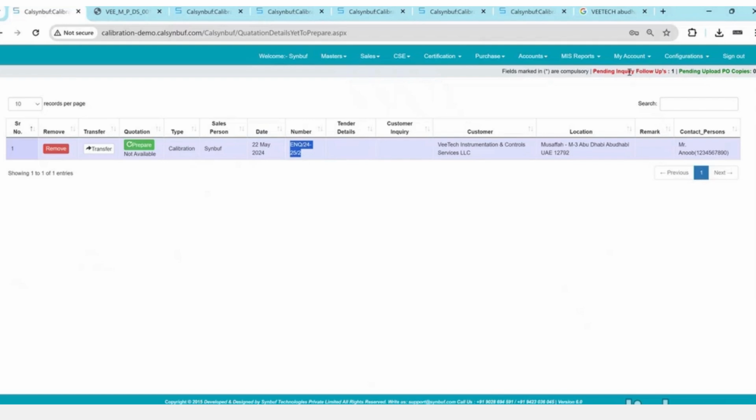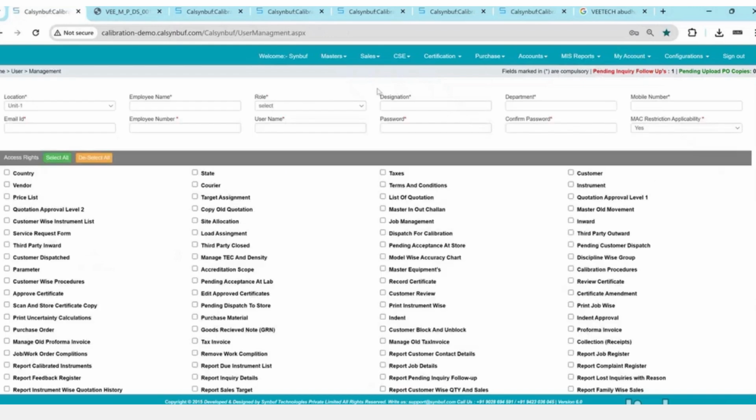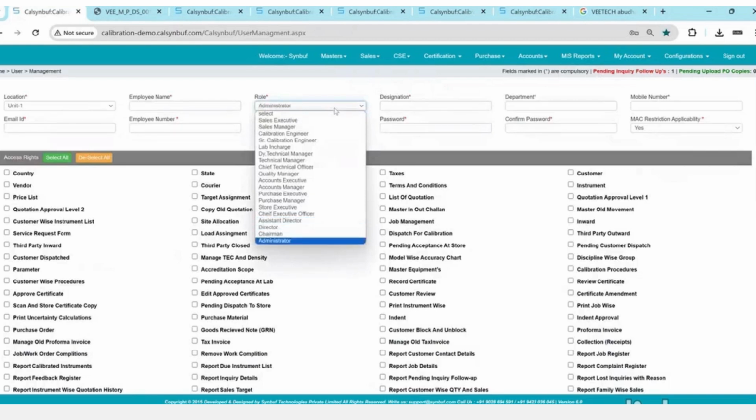Now I have only one pending inquiry follow-up. I have to clear that, being a sales executive. And here I can see only the inquiries that belong to me. In user management, if my role is director, assistant director, or chairman, then I can see inquiries belonging to all people.